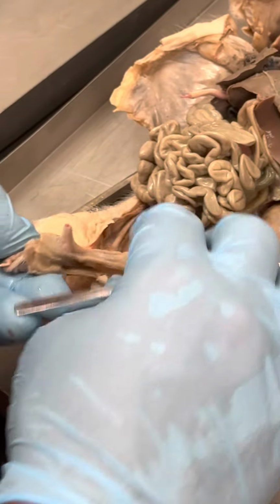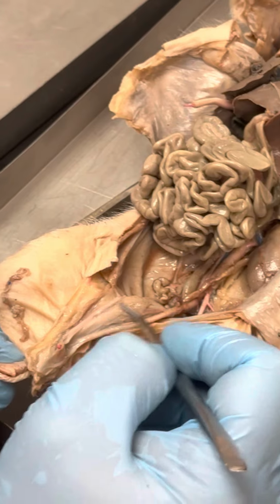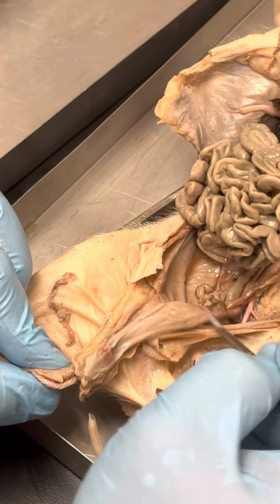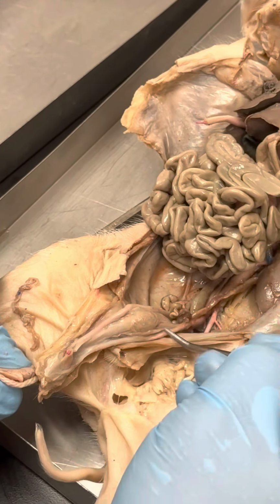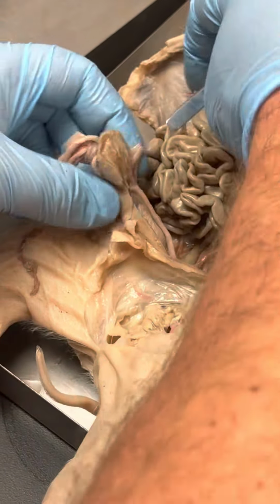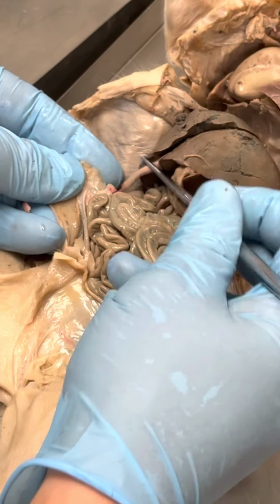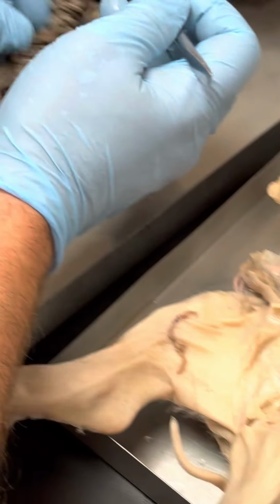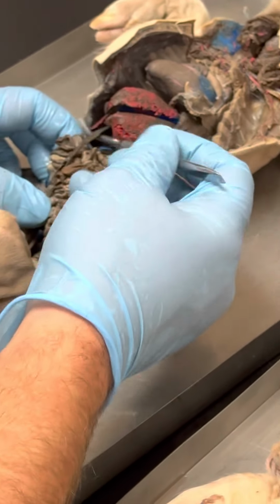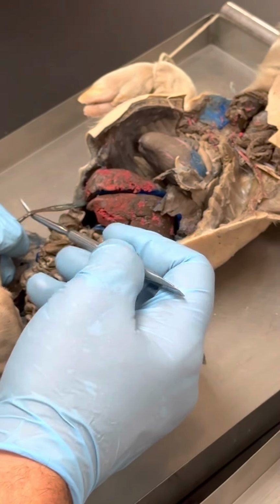Umbilical arteries. So this is your urinary bladder right here. On each side of your urinary bladder are your umbilical arteries. Umbilical arteries. Now your umbilical vein, this part was attached to this at one point. So that is your umbilical vein. It's on this one. We could see it more gooder over here. Is gooder a word? Yeah, from where I'm from, it is. So this is your umbilical vein.